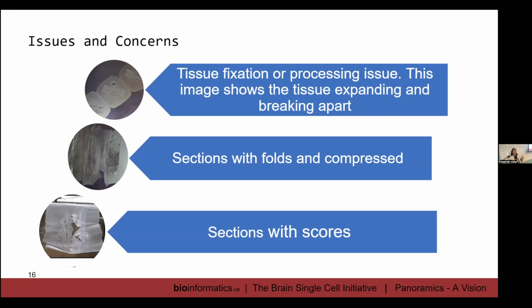So again, that needs to be done properly. There are ways around that. Us in histology have all the tricks and methods to try and get that out for you. So I highly recommend using a histology lab when you're asking for your sections.